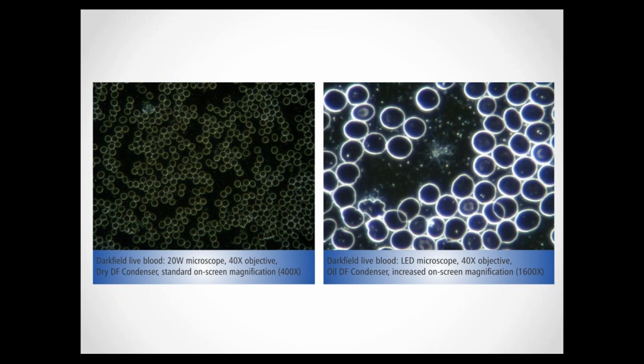Generally, microscopes produced in China are usually much cheaper. Most of the microscopes available online are actually from China, even those sold on websites in the USA. Now, the main problem with Chinese microscopes is not that all of them are of inferior quality. Some of them are actually quite good, but many of them are not good at all, and it's not always possible to tell them apart, and that really is the main problem.